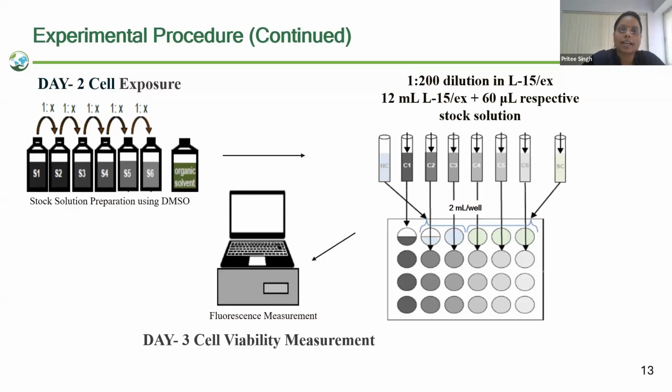So here, 3,4-dichloroaniline is insoluble in water. So a solvent, that is DMSO, was utilized to prepare the stock solution. Depending upon the concentration, the stock solution was prepared. As per the guideline, at 1%, the organic solvents are non-acutely toxic to the cells, but the guideline has recommended to use only 0.5% volume by volume. So here we have prepared 200 times more concentrated stock solution and then added it in L15 medium. In each well, 2 ml of dosing solution was added.